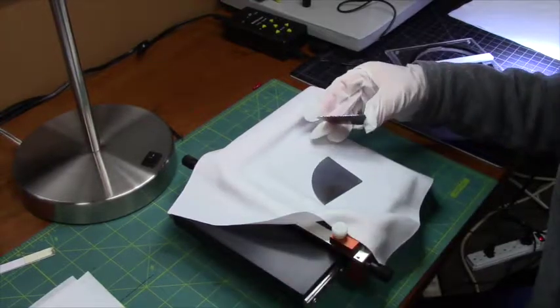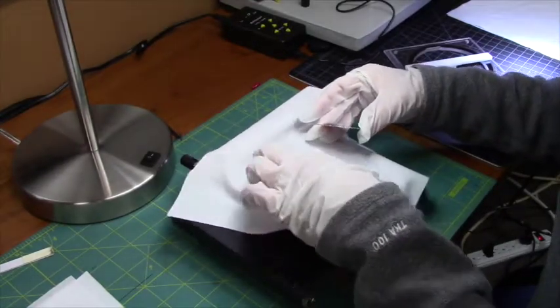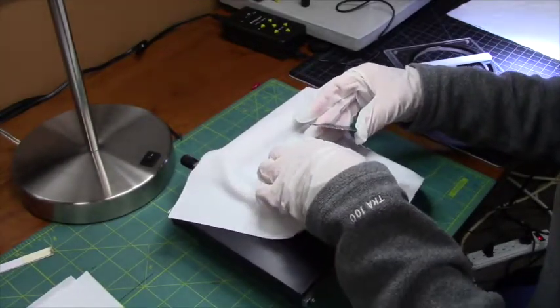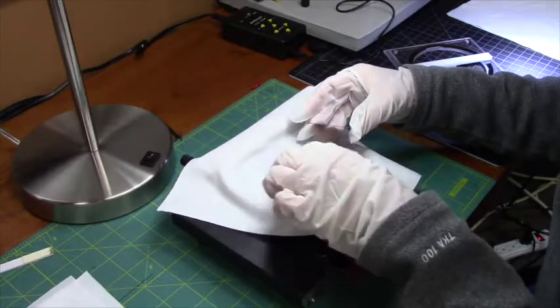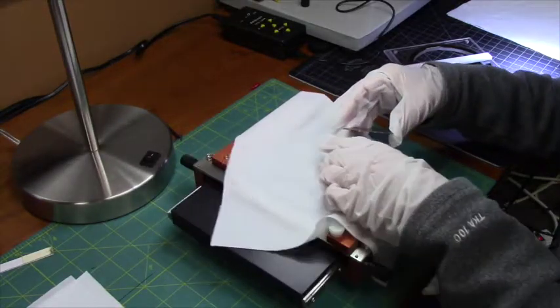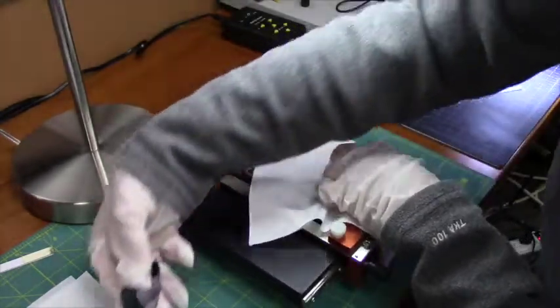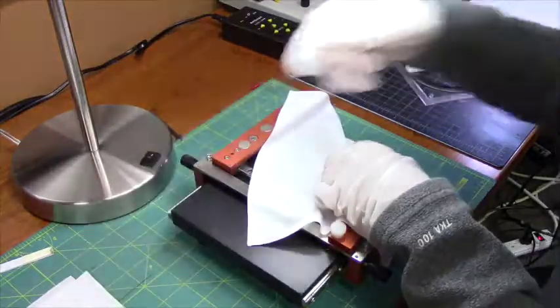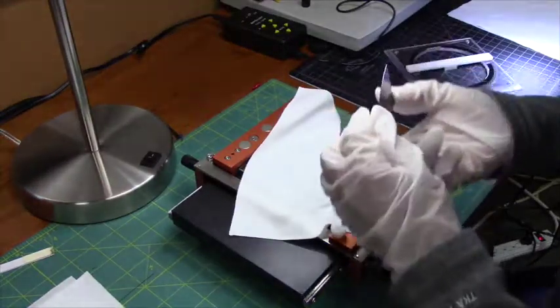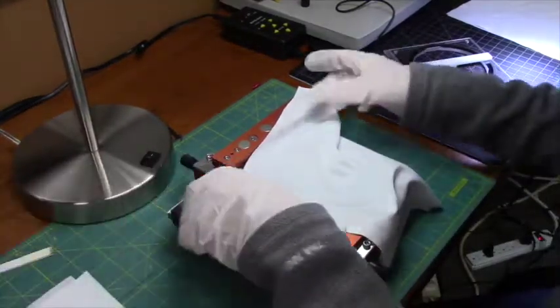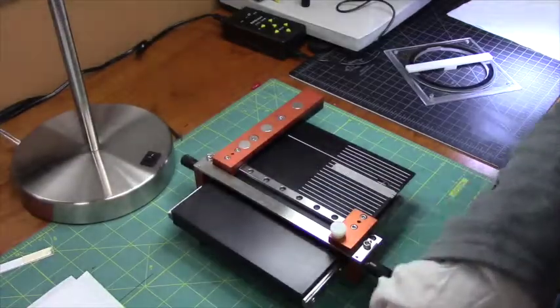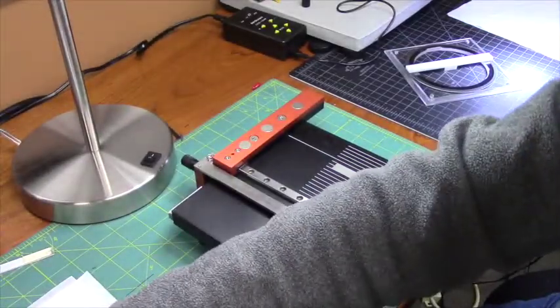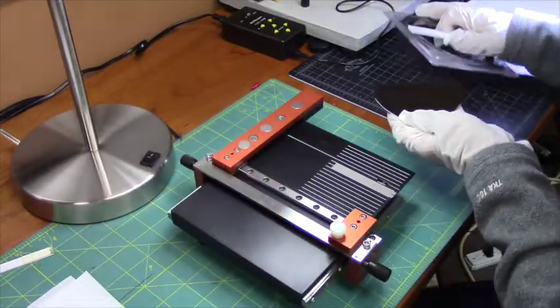This time I have cleaved along the scribe line. So that half is complete. And I will repeat the process once more to finish the preparation.